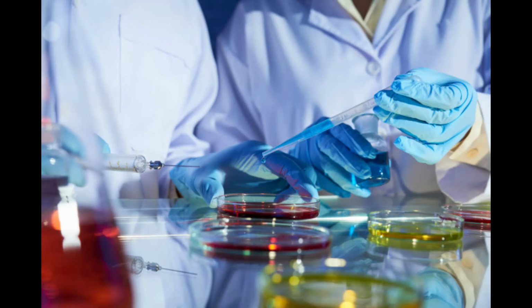So you got your micro. You'll bring it back to where you're working, and you'll have all your different stuff that you're transferring to. Labeling will be a big deal. It's not as big of a deal this time because you only have one micro, and you have one of each. And so as long as you can remember what they're called, other than putting your name on it, you don't really have to do a lot of labeling. But label whatever you need to before you ever get started.